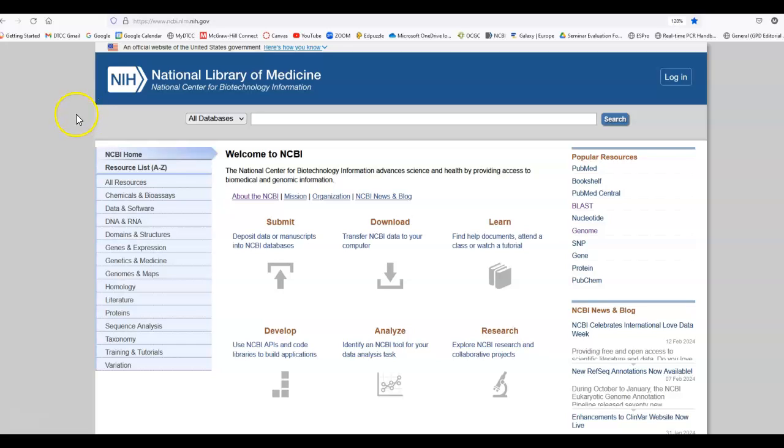Generally, you get here to this main page. You can see on the left there are all kinds of resources where you can be more specific and look at any of these. We'll look at some of them later. Some you may find interesting are the training and tutorials, which is here, and also here. If there's anything you want to try, or it's a little different for your assignment than this particular video, you can go there and find it. But generally speaking, I like to start off with a general example to show you some of the fundamental things it can do.